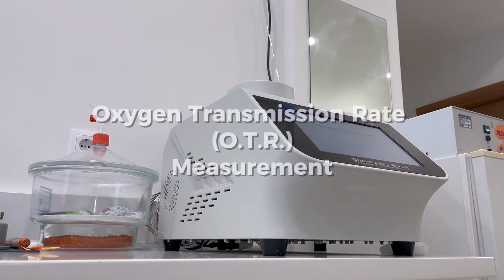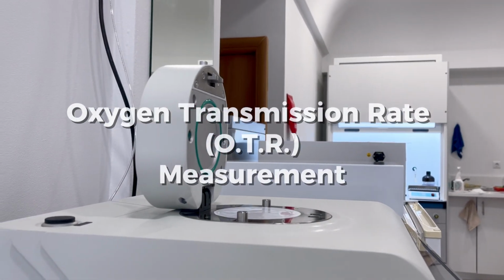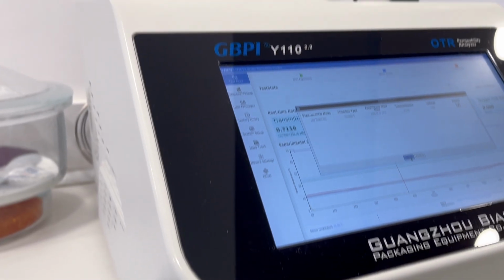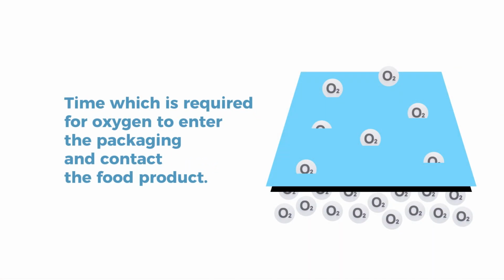This analysis, known as the oxygen transmission rate or O.T.R measurement, is performed using specialized analytical instruments. Measuring the O.T.R of a packaging material is essential for determining how long it takes for oxygen to enter the package and reach the product.